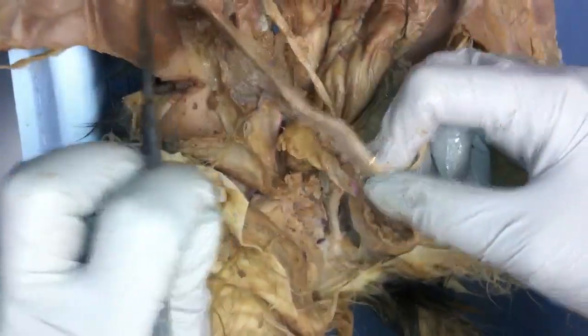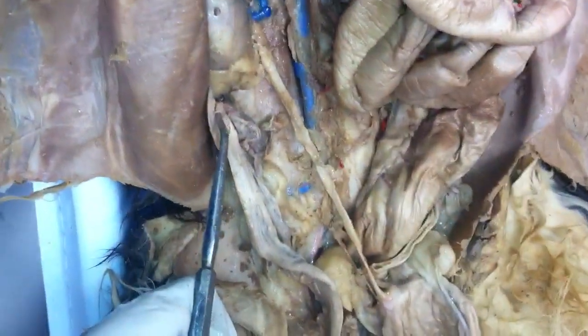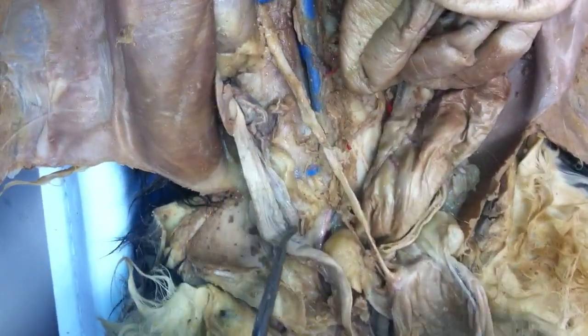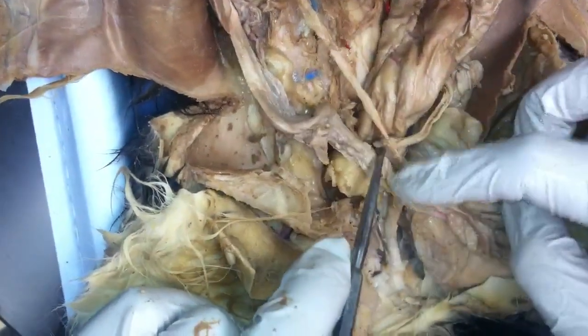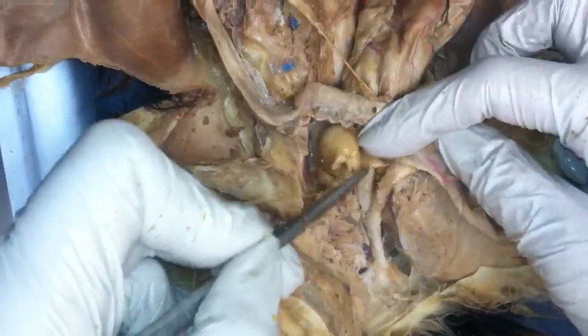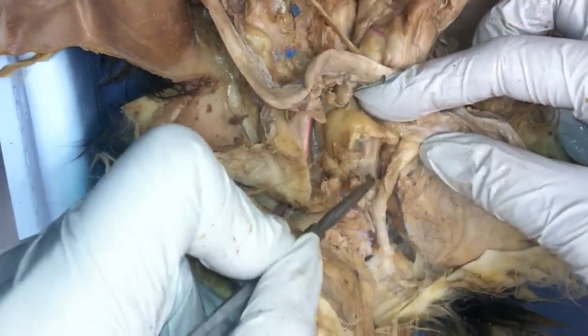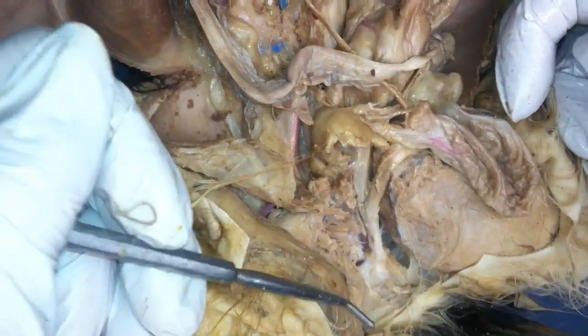And then the reproductive, we've got the ovary with the uterine tube into the uterine horn. And the place where the two uterine horns meet is the body of the uterus. And then behind the urethra, down here, this is the vagina and the urogenital sinus where the two tubes meet.